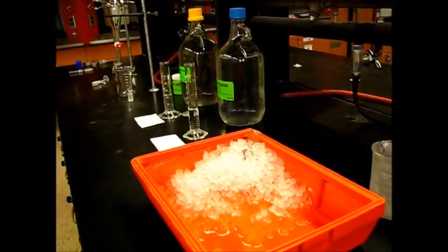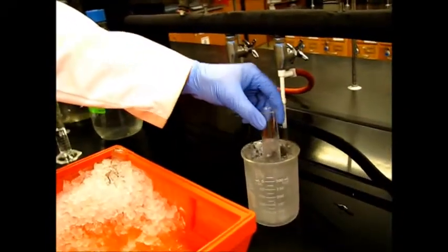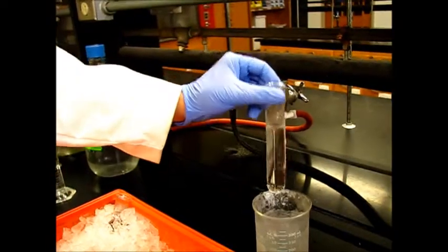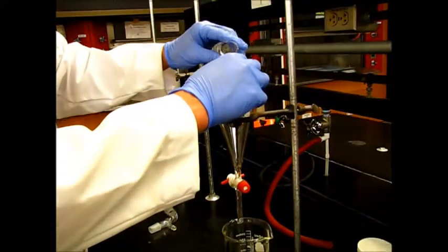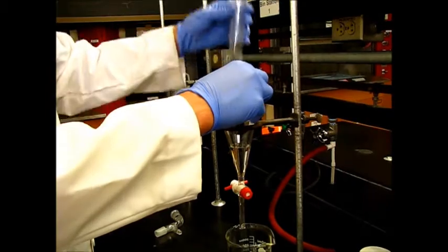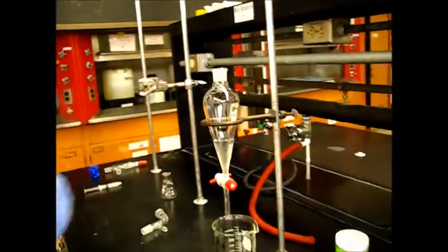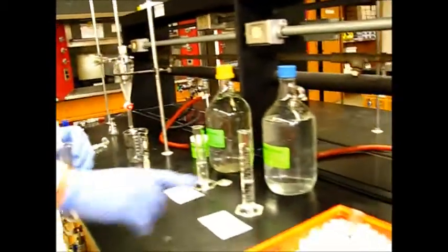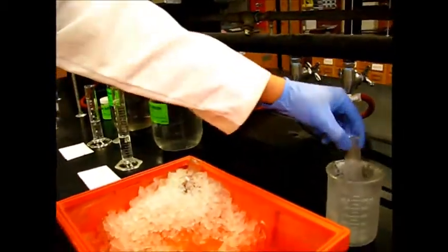After the ice bath, we will transfer into ice cold water. Yeah, we'll do it into the separatory funnel. So first, what we're going to do is add about half or two thirds of this into the separatory funnel. Make sure that it's closed. This is cold water? Yes, cold water right here. Ice cold water. Cool. So once that cools down a little bit more, we'll go ahead and add that to the separatory funnel and then finish off the rest of this.